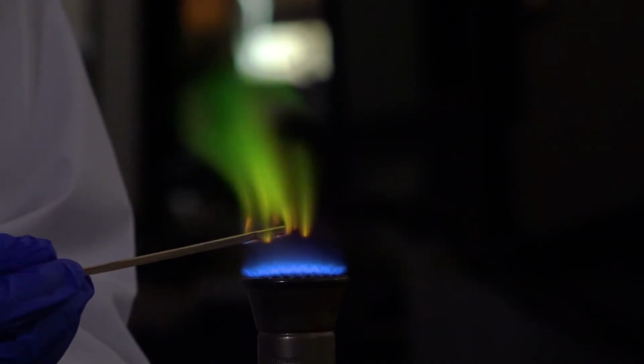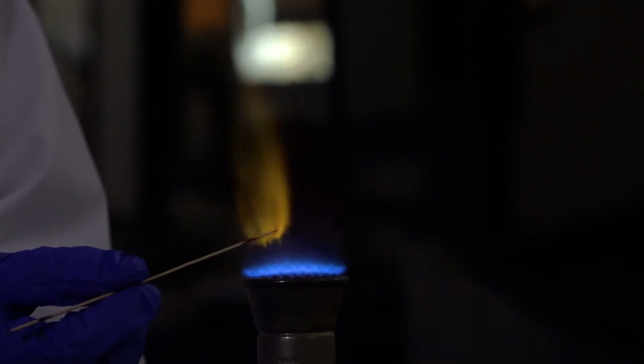We're going to do that again so you can see the color. Next, we're going to try out barium chloride. Here you can see that it's kind of yellowish. I'll do that again.